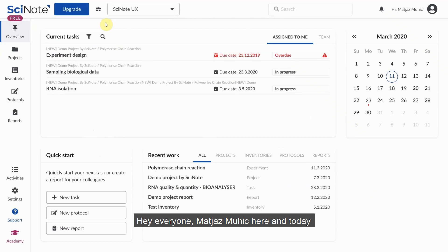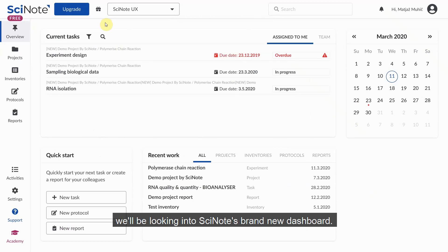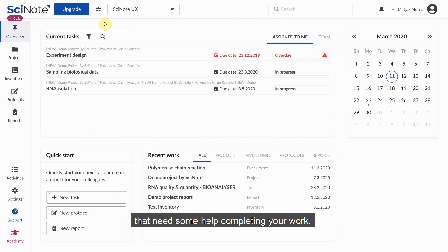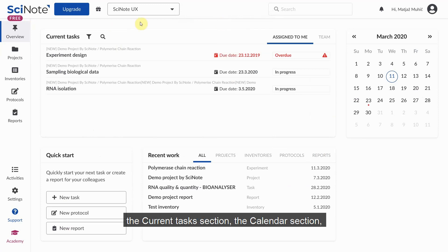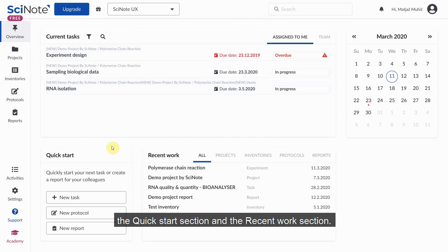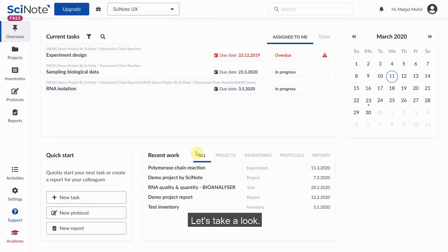Hey everyone, Matias Muhic here, and today we'll be looking into SciNote's brand new dashboard. It's task oriented for all you scientists out there that need some help completing your work. It is comprised of four sections: the current task section, the calendar section, the quick start section, and the recent work section. Let's take a look.